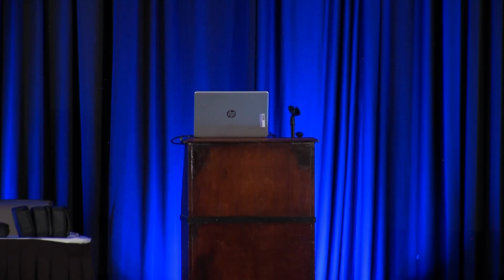And that application is designed to do the measurement in 5 minutes per cycle. So basically you can measure 3 cycles in that 15 minute window. Actually, you do have a compliance requirement. You have to meet ASTM 7164. Otherwise, they won't accept it. Yeah, I think I'm just talking about cycle time, but yes, we do understand there are requirements to be compliant, which is not the scope of this paper.